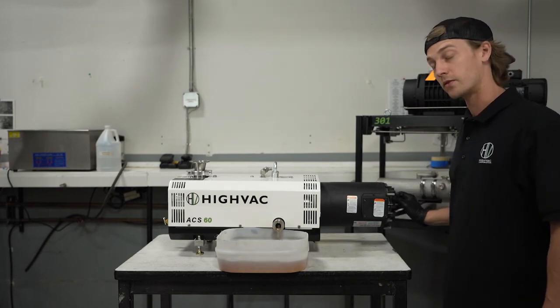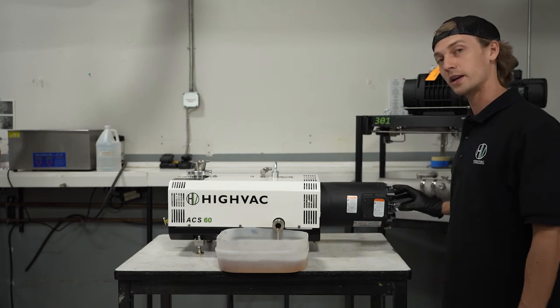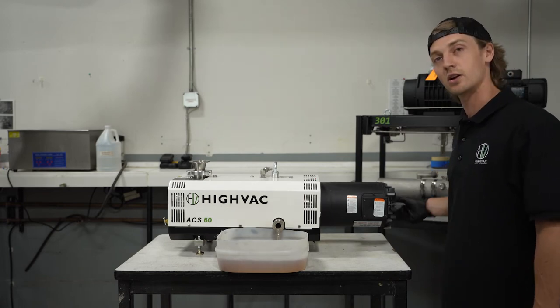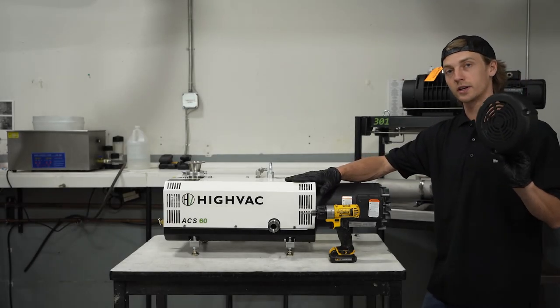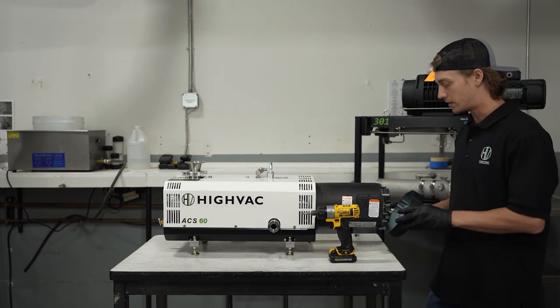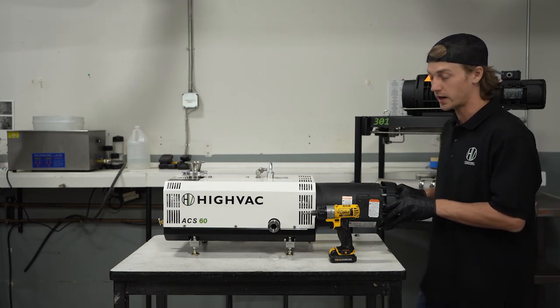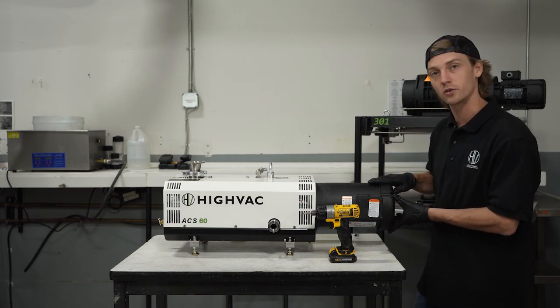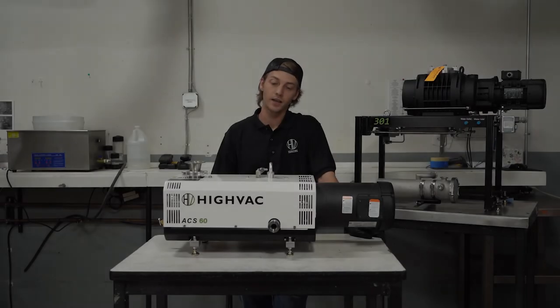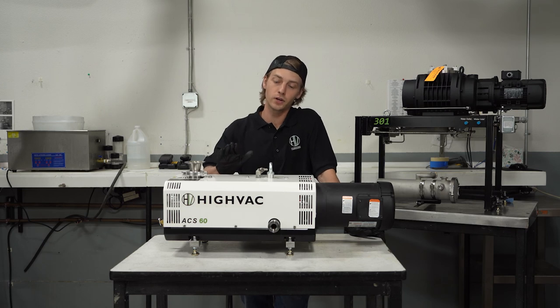If your solvent is coming out very dirty, we recommend running additional cleaning cycles until the solvent comes out nearly clean. Once the pump has fully drained, replace your motor fan shroud. It's very important to replace it, as this is an air-cooled motor and it runs the risk of burning up if the shroud is not replaced.